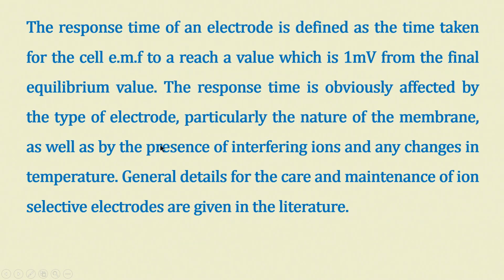It is also affected by the presence of interfering ions, and any changes in temperature also, because most of these semiconductors have characteristics which are responsive to changes in temperature.